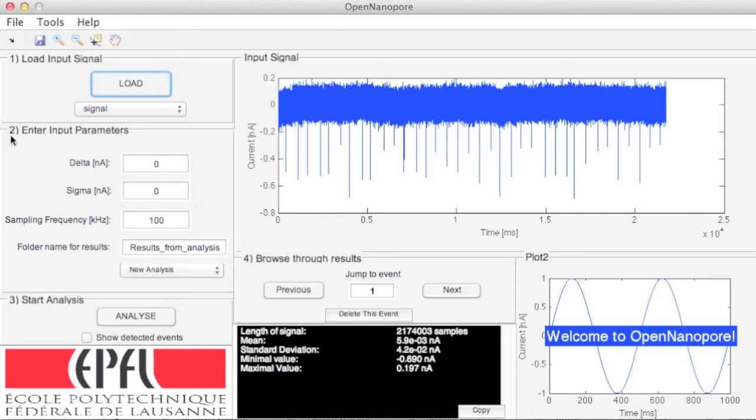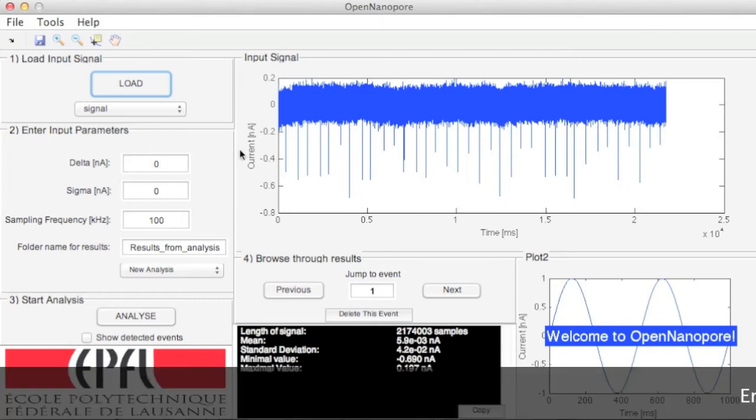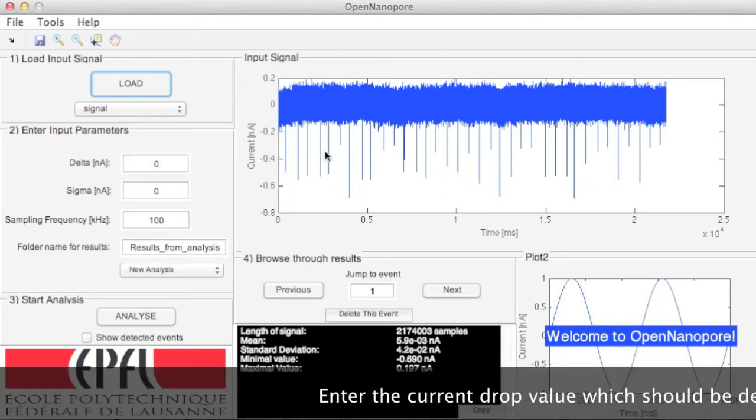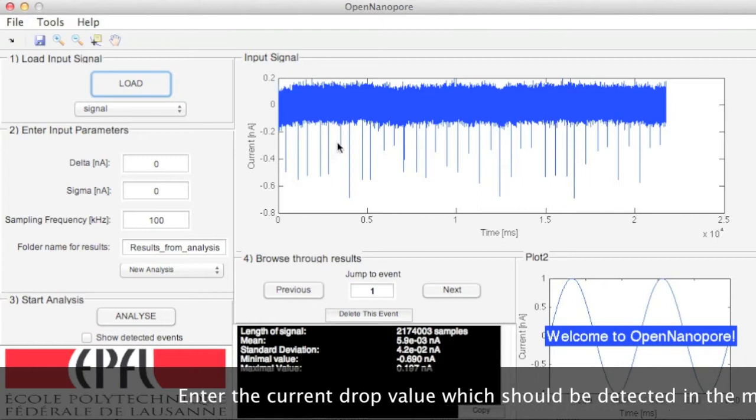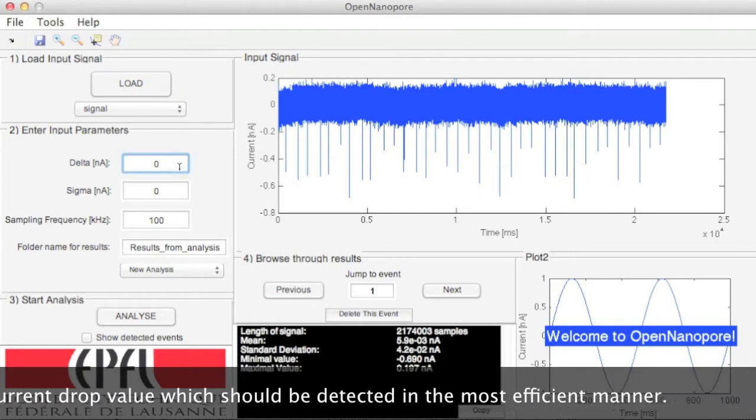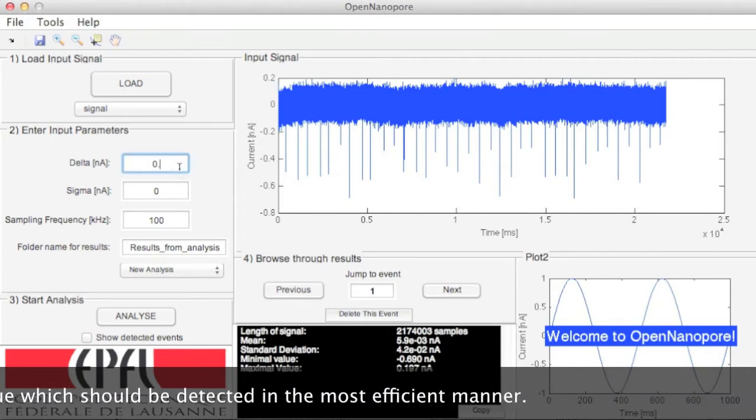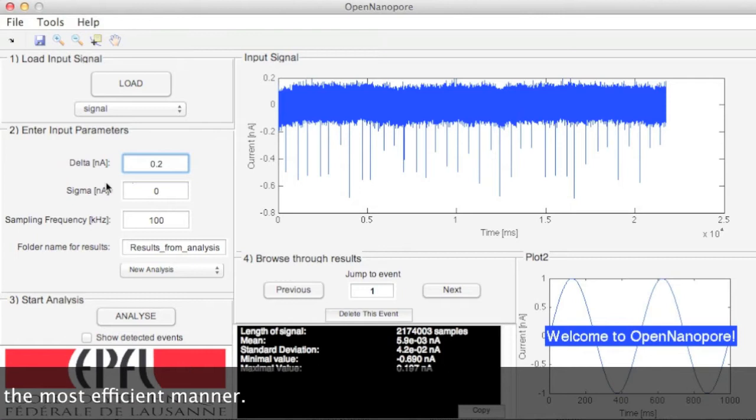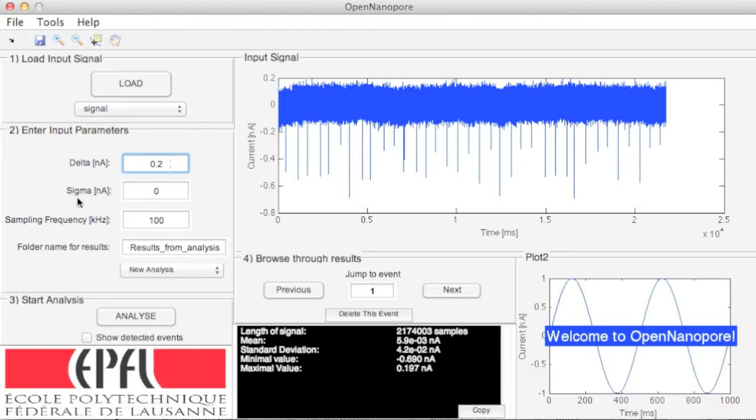Then, enter your input parameters. Delta is the most likely current drop in nanoamperes that you want to detect in an efficient manner. In this demo case, 0.2 nanoamperes is a typical current blockage value for lambda DNA translocation.